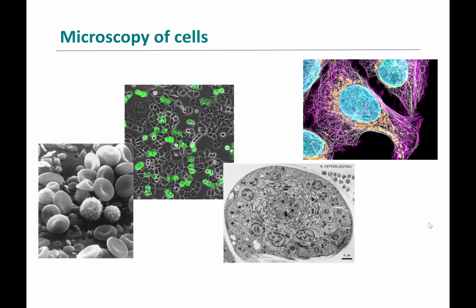Okay, this lecture is about microscopy. This semester, we'll talk about lots of different ways and techniques to study cells. First one we're going to talk about is microscopy. This is used to look at cell structure, look at gene expression, and it can be very, very specific.